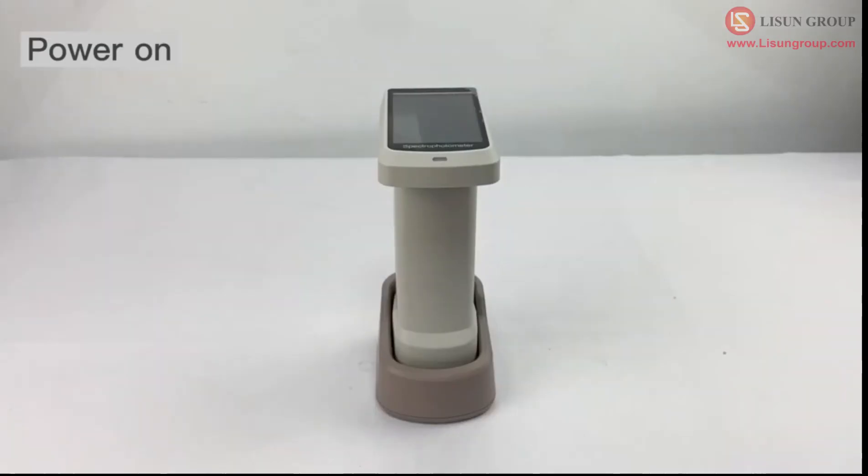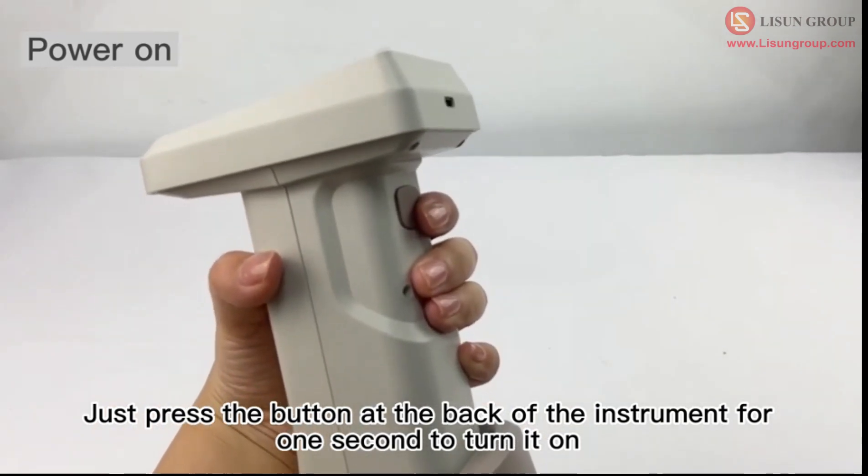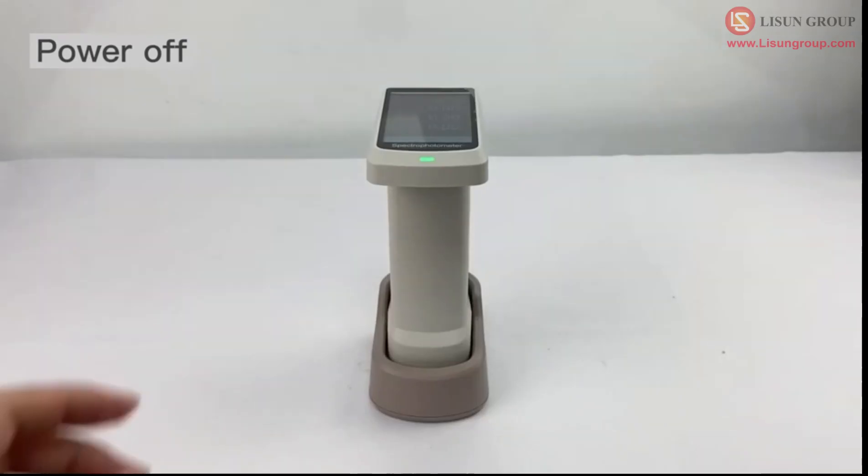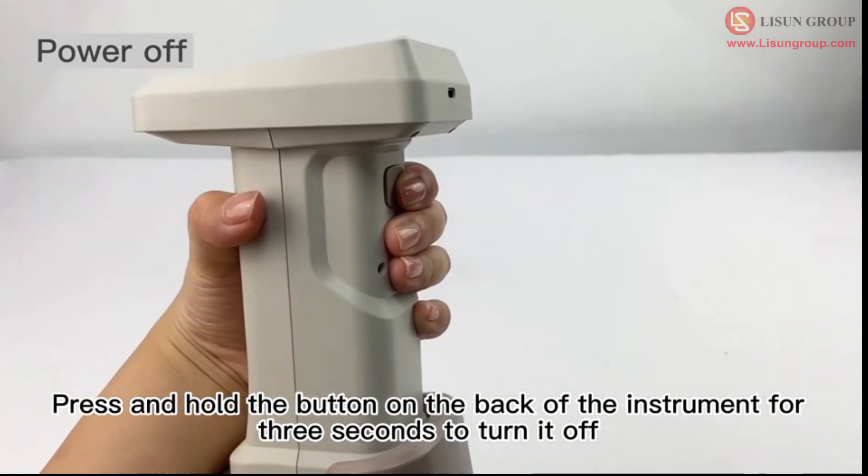Power on and power off. Just press the button at the back of the instrument for one second to turn it on. Press and hold the button on the back of the instrument for three seconds to turn it off.